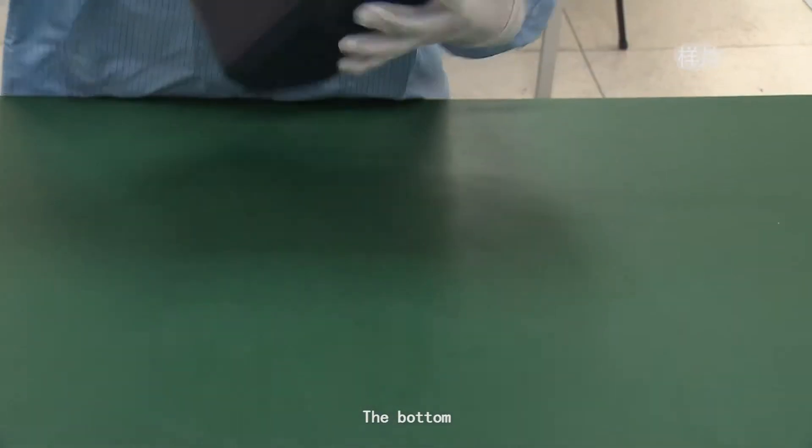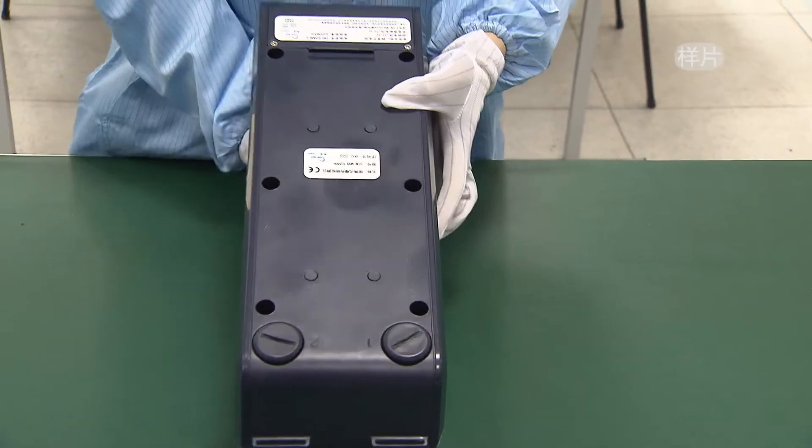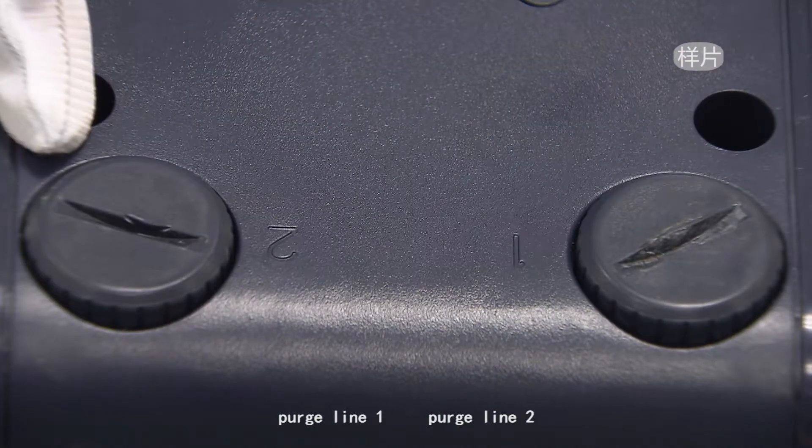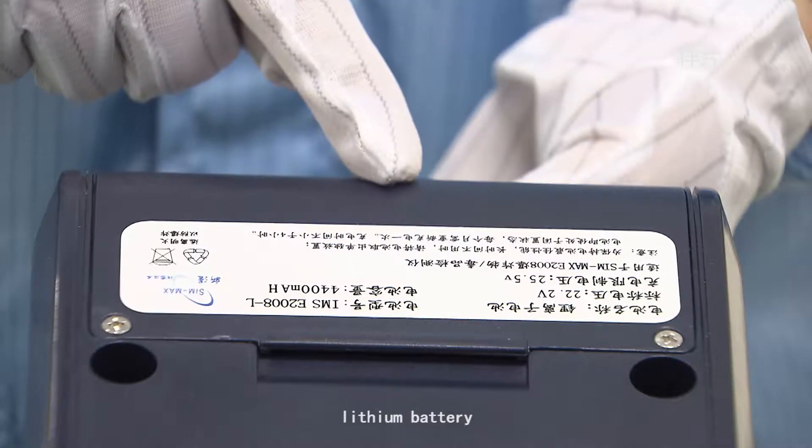The bottom of the device features purge line 1, purge line 2, and the lithium battery.